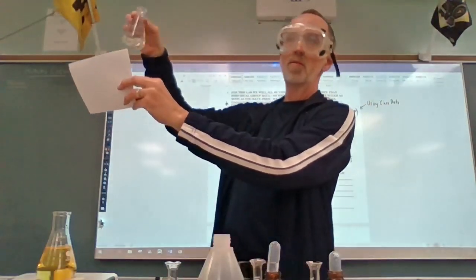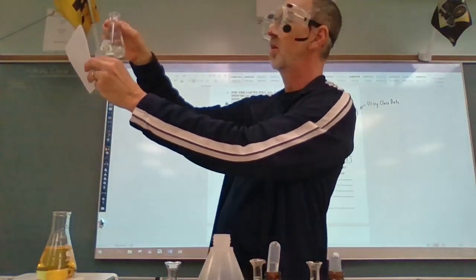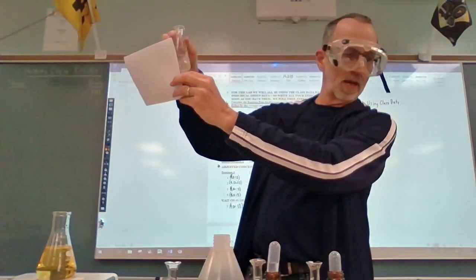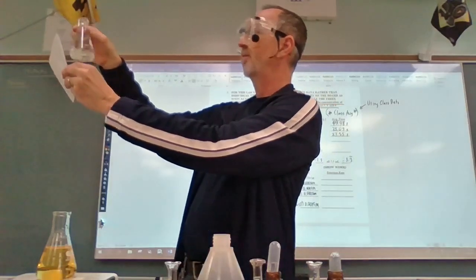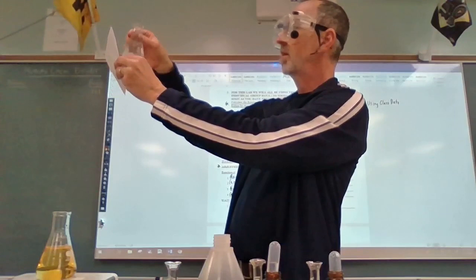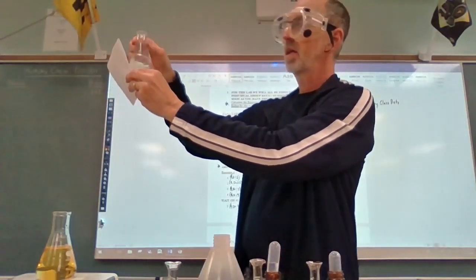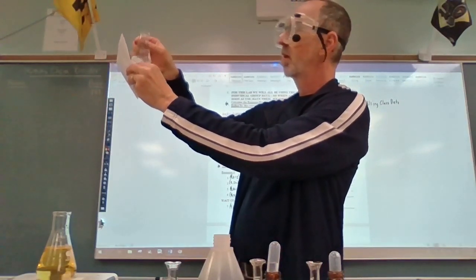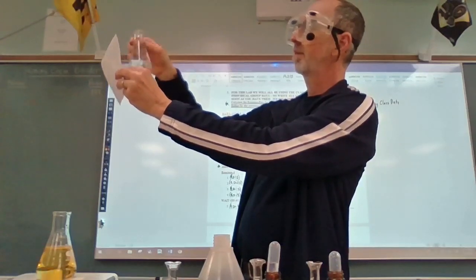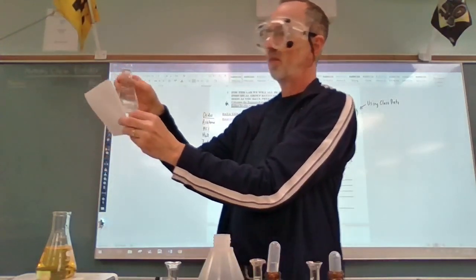Now this one's a little bit more colorful. The yellowish brown color is more prevalent because we used 10 mLs of it this time rather than 5 as we did before. So this has got more iodine comparatively. So my guess is it's going to take longer for this color to fade. Just guessing, of course. Okay. Yeah, it definitely has slowed down from the last two.